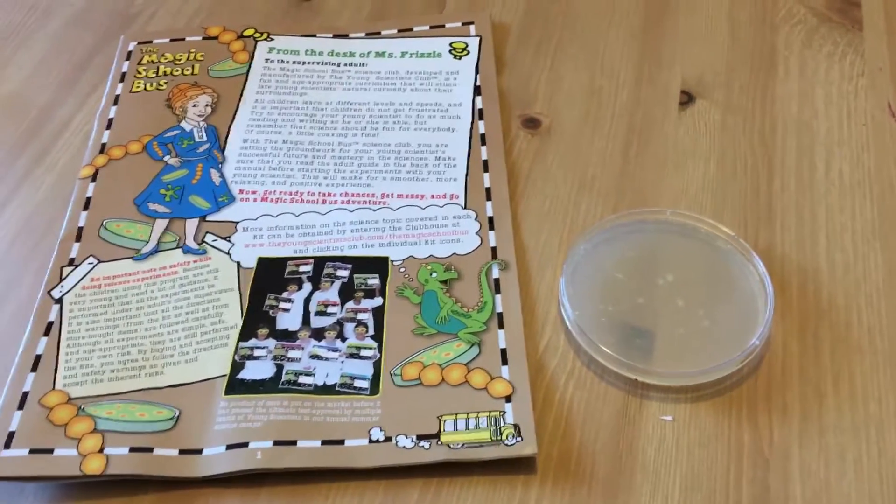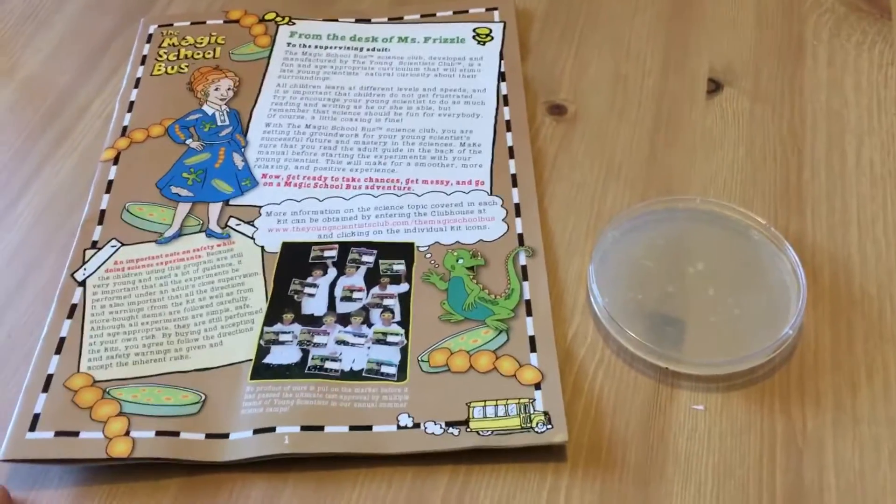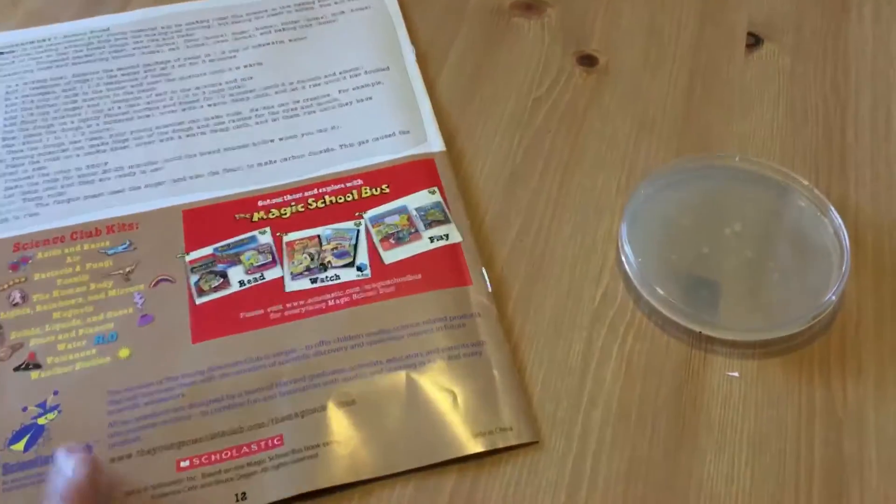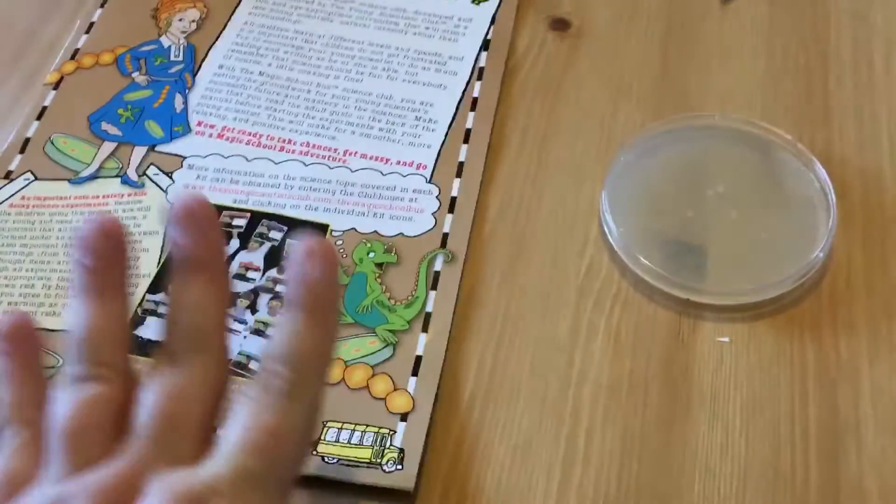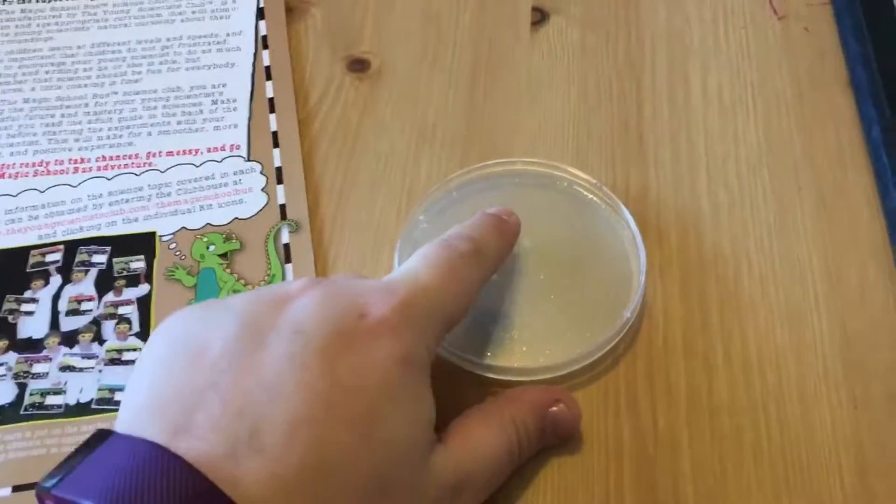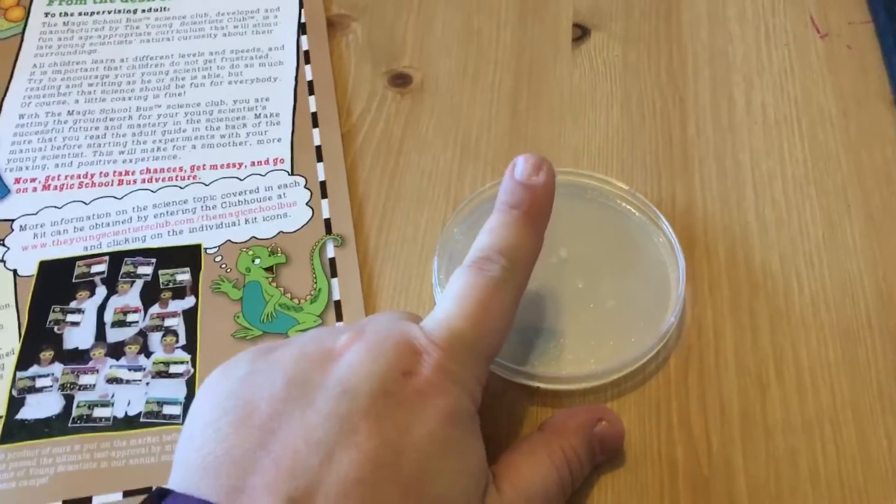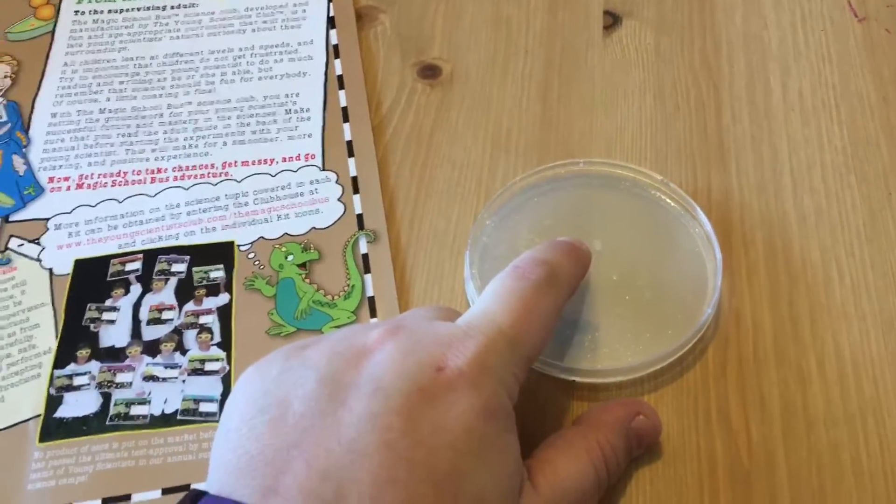All right, so for today, which is day two of our Magic School Bus Young Scientists Club bacteria and fungus kit. Yesterday we made the agar, prepared the agar and put it in the petri dishes, which that video is already up.